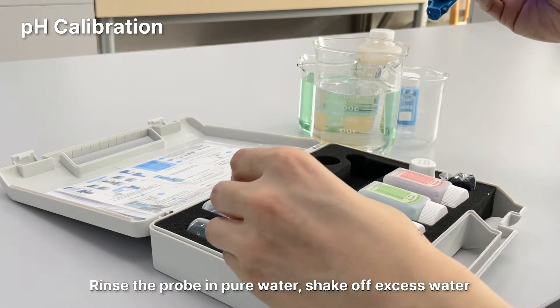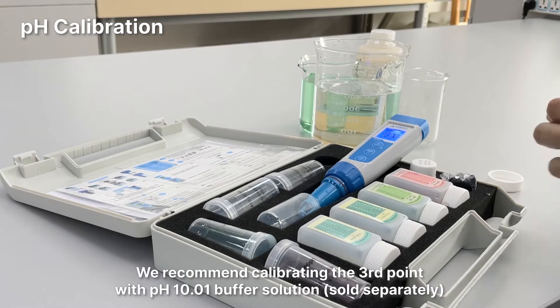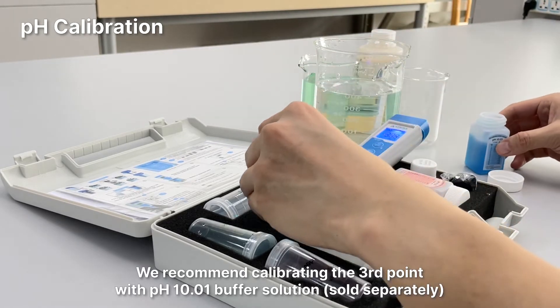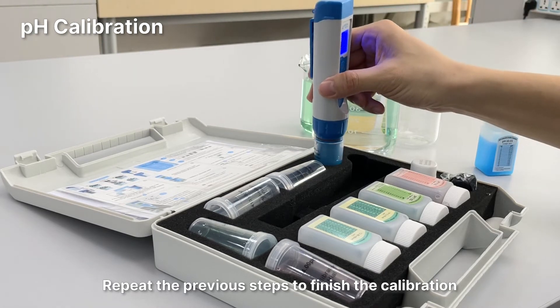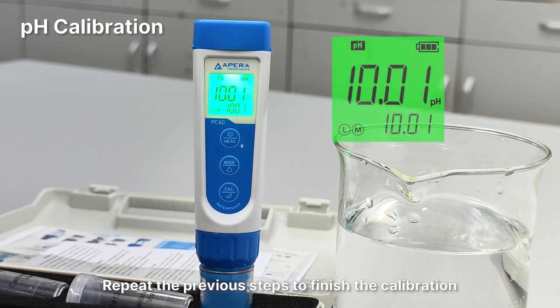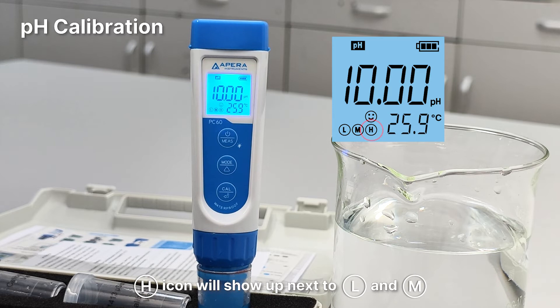Rinse the probe in pure water and shake off excess water. If the estimated pH value of your sample is greater than pH 8, we recommend calibrating the third point with pH 10.01 buffer solution. Repeat the previous steps to finish the calibration. The H icon will show up next to L and M, indicating a successful three-point calibration.